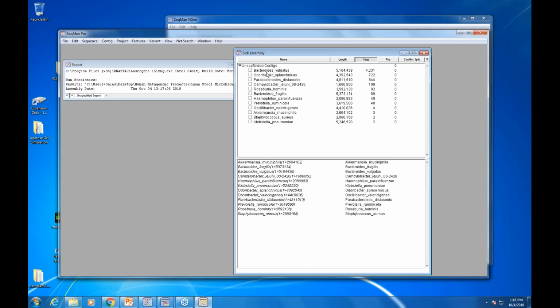And I see some others, and I see a Campylobacter. Campylobacter you probably don't want in your intestines. So this is a sick person. That one would jump out at me as saying, well, that is not something you ever want to see showing up. And then I see this Haemophilus as well. That can be a problem. So I see a couple of bacteria here that, while they're not at really high levels, you don't typically want to see in a normal gut.